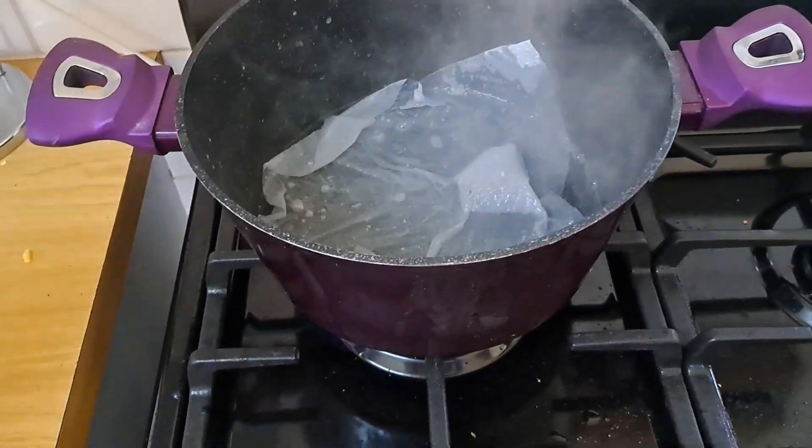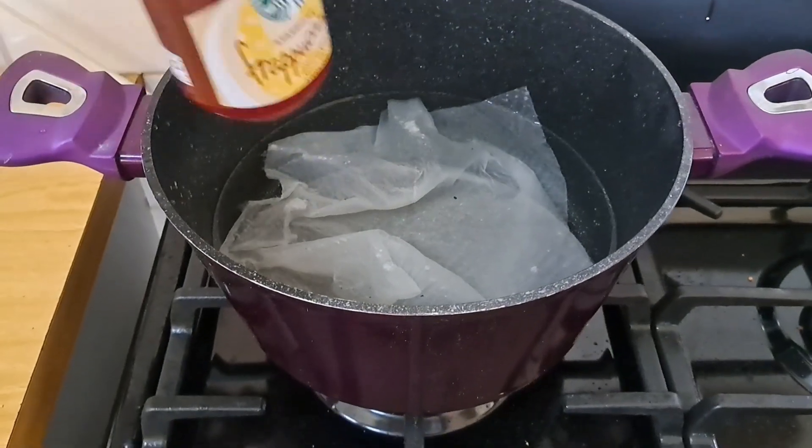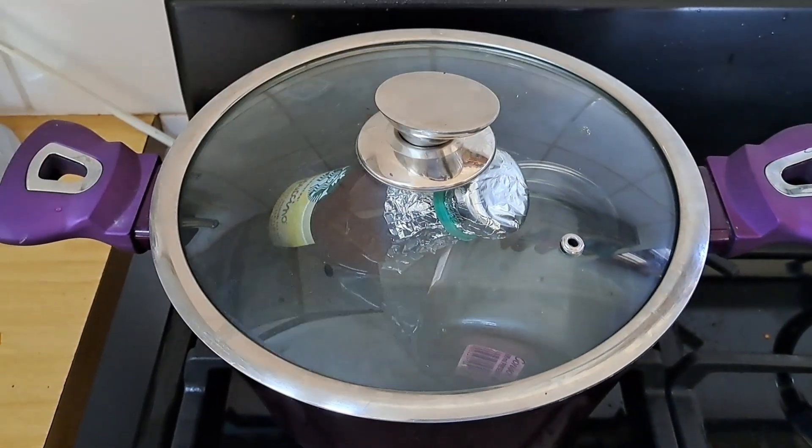I put my pot on the stove and place a paper towel at the bottom so the glass doesn't touch the pot directly, which can sometimes discolor the pot or the glass. I fill the pot about halfway with water. Since my bottle doesn't fit upright, I place an empty jar in the pot and lean my bottle against it. I put the lid on and turn the stove to high heat. Only start the timer when the water is boiling. If using a pressure cooker, start the timer once it reaches 15 PSI.